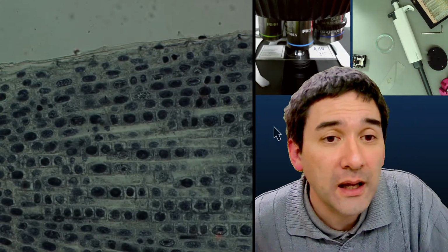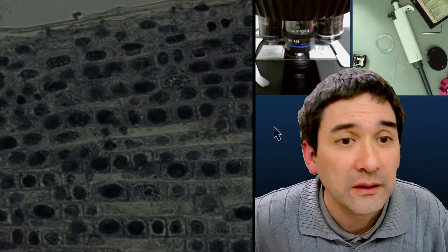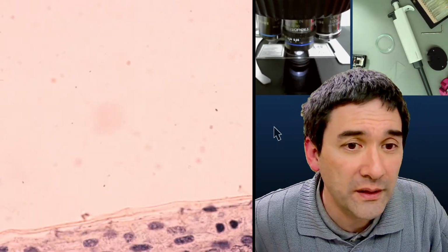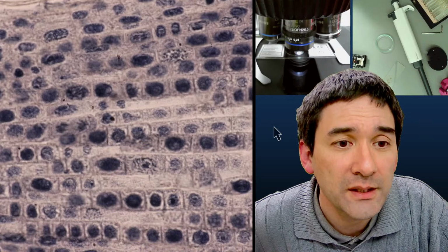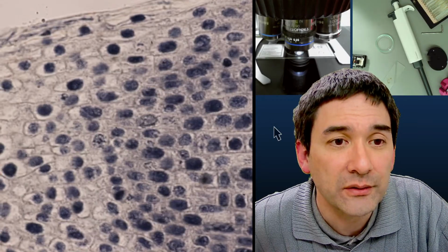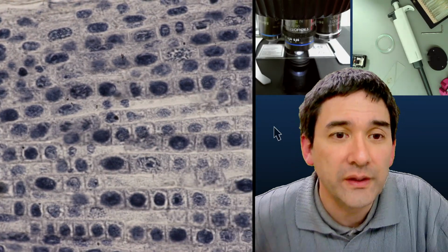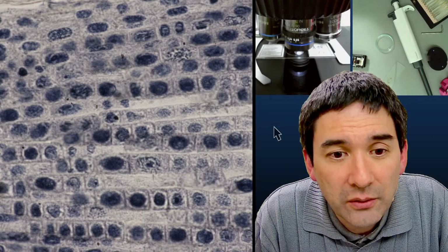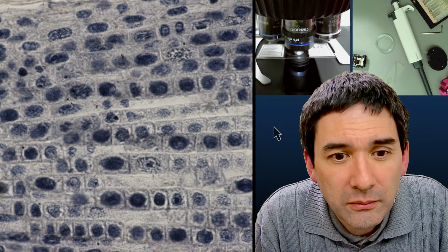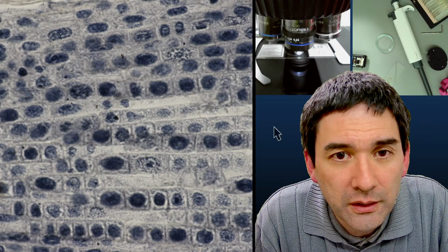This is usually the time when you have to be very patient and start looking. What I'm going to do is turn off the DIC and use just the regular bright field. This is also one of the activities that I'm doing with my students here. And what you see over here, I can already see chromosomes. I need my arrow now. Okay, where's the arrow? Here we go. Here's the arrow.